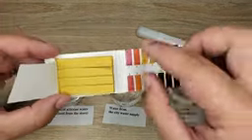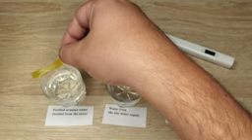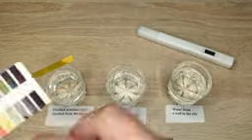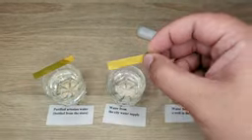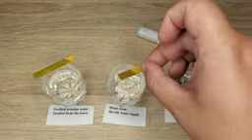Another important analysis is the determination of the pH of water. For drinking water, the pH index is from 6 to 9. The easiest way to determine the pH number is with litmus paper. With these things, you will be able to evaluate the water you use or plan to use.